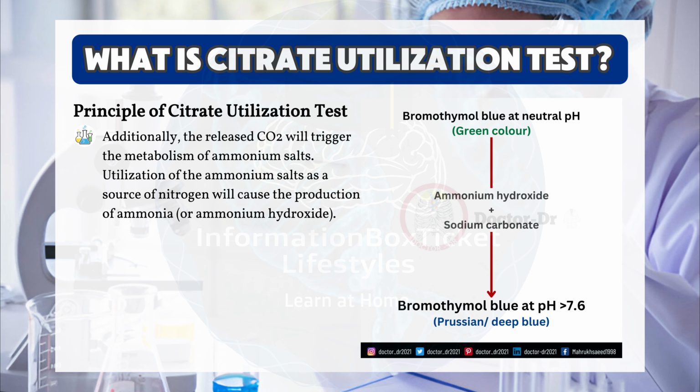Additionally, the released carbon dioxide will trigger the metabolism of ammonium salts. Utilization of the ammonium salts as a source of nitrogen will cause the production of ammonia, or ammonium hydroxide. Ammonium salt gives ammonium hydroxide, alkaline.